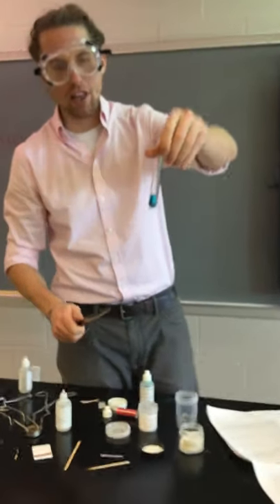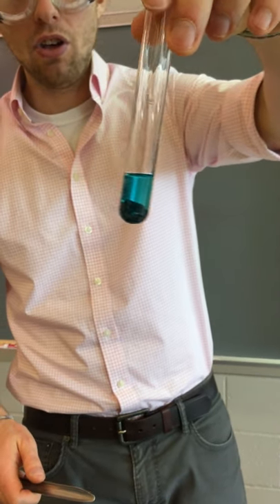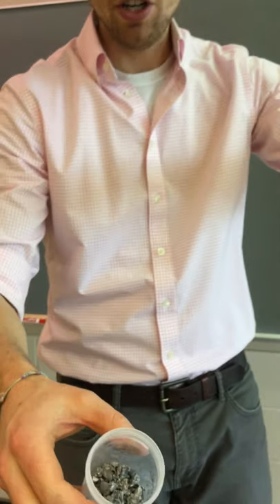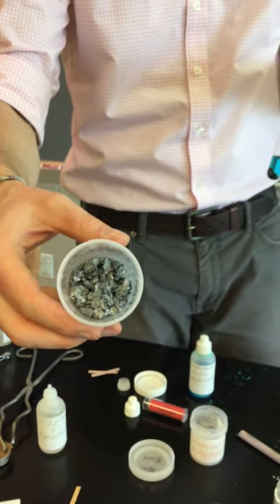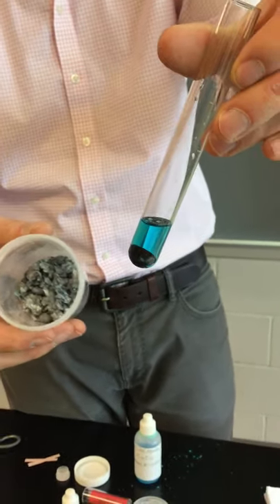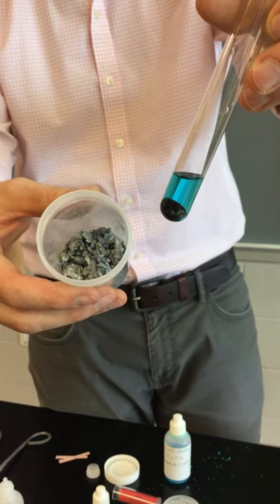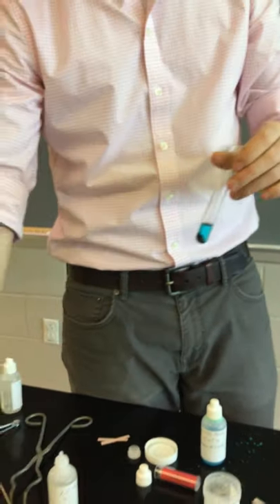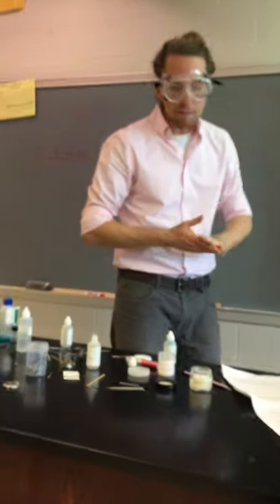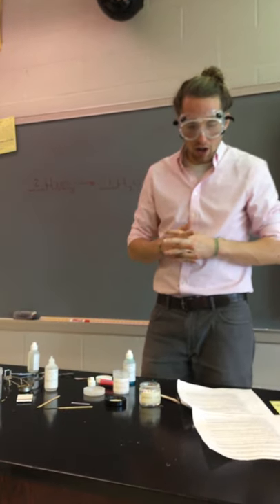And let's see what happens there. Now this reaction isn't doing anything initially. You can see the zinc is kind of just sitting in that copper chloride. Now you might be able to see on camera there that it does look a bit darker. So if I show you the zinc and what it looks like originally, we have a pretty pale colored gray metal here. And as you continue to look at what's going on in the reaction, you can see that it's getting darker and darker. So that's good evidence that we have a color change and something is happening. You could probably predict what it is if you complete that reaction on your own. So that was reaction five. Again, reaction six we already saw. That was the copper chloride and the sodium phosphate. Let's move on to reaction seven.